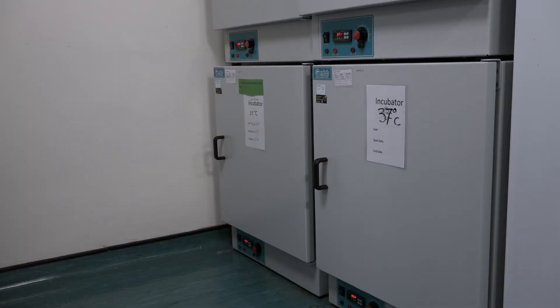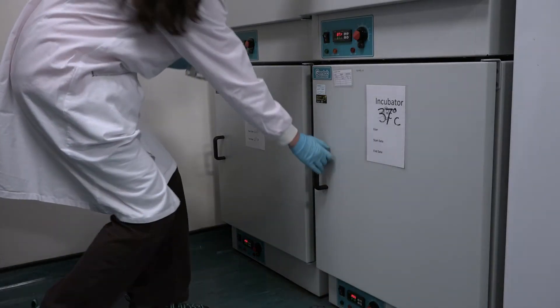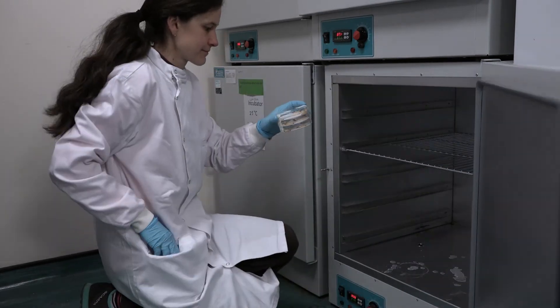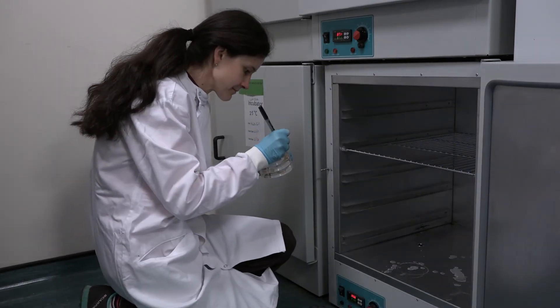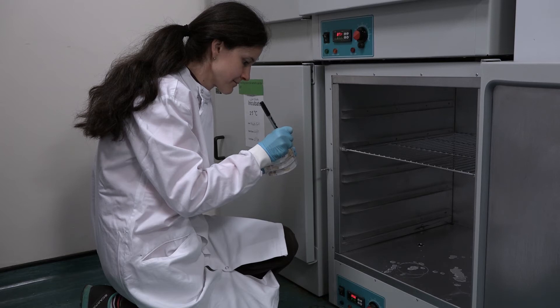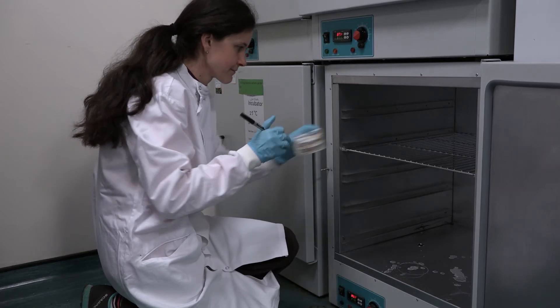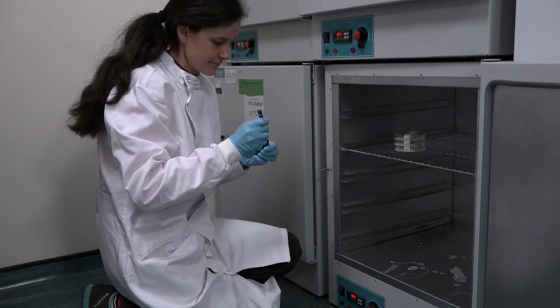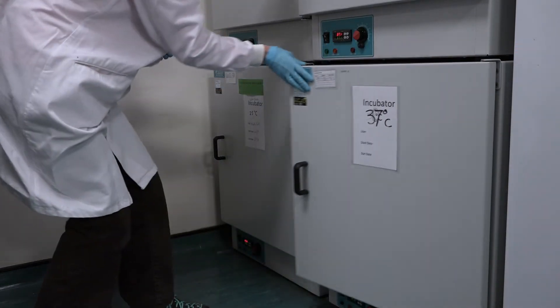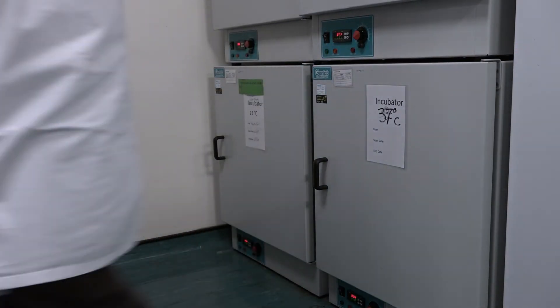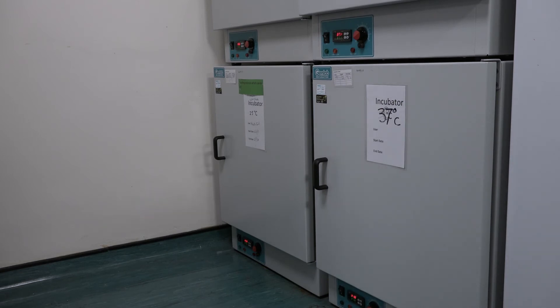Once injected larvae can be incubated at 37 degrees. Another advantage of the Galleria melanella model system is that temperature regulated genes can be switched on at human body temperature. Multiple time points may be used to assess larvae, for example 4 hours, 24 hours, 48 hours and 72 hours post injection.